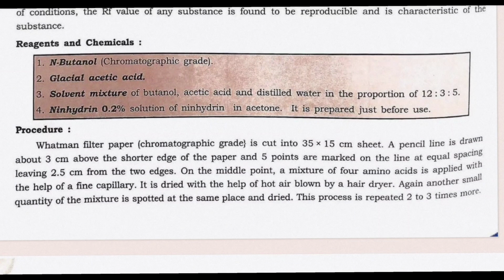A pencil line is drawn about 3 cm above the shorter edge of the paper and 5 points are marked on the line at equal spacing, leaving 2.5 cm from the two edges. On the middle point, a mixture of 4 amino acids is applied with the help of a fine capillary.